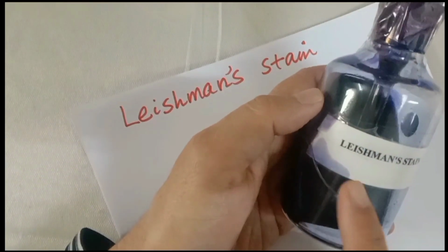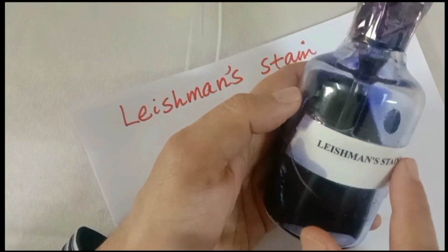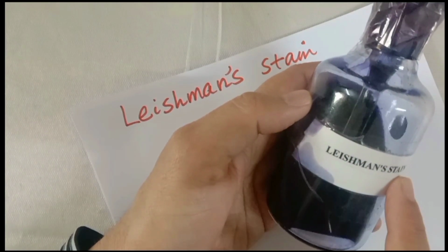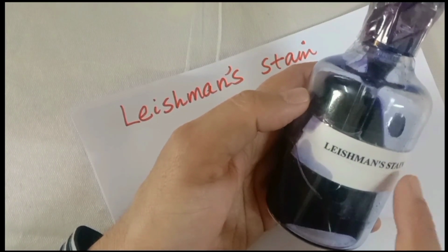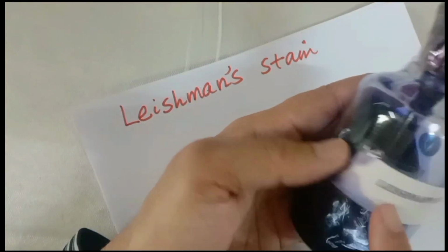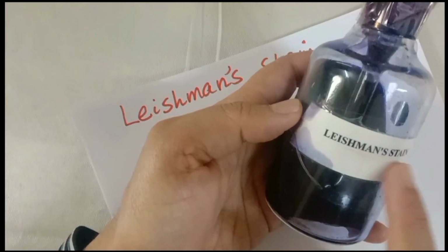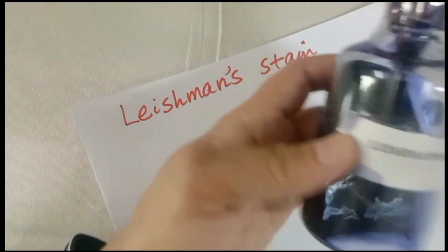In this video, we will discuss the Leishman stain, what the composition of the Leishman stain is, and the functions of the different components. As we know, this Leishman stain is used in staining the peripheral blood smear. So I will start with it.